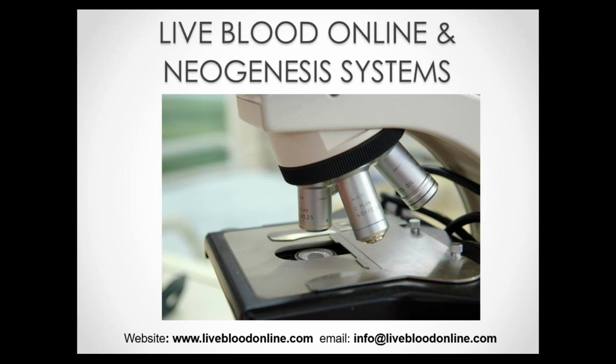Now, we all know that in chronic conditions, the symptoms really only start improving after the fundamental cellular imbalances have been corrected. And this usually takes some time, and with live blood analysis, we are actually able to show the patients during the course of treatment that their condition is improving at the cellular level, even if they might not yet be feeling a significant improvement.